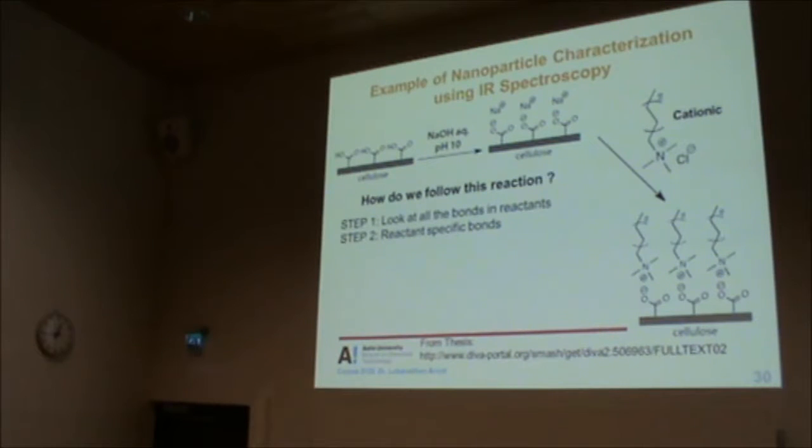And then this is the reactant that you're adding. So all that you need to do is to find out, is there any bond differences? Are you introducing any new kinds of bonds by introducing this molecule? I can tell you in the starting material there was no nitrogen, but in this molecule there is nitrogen. So that's a huge difference. That's a good starting point.